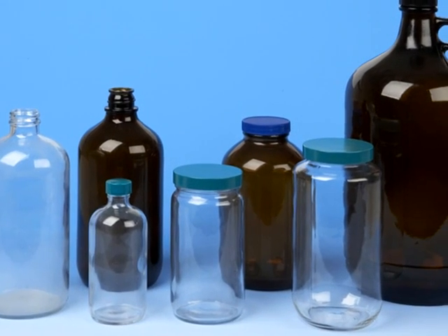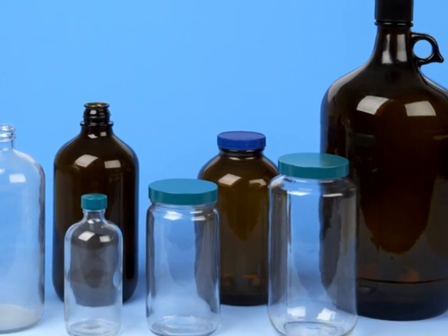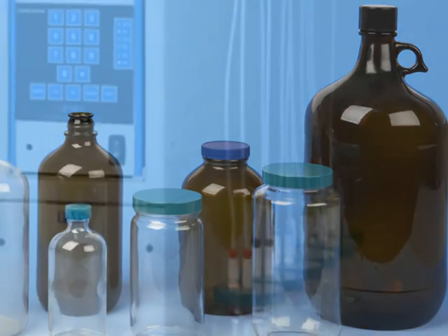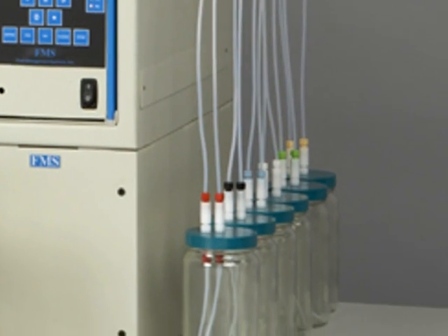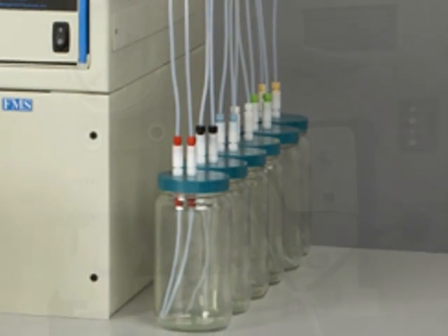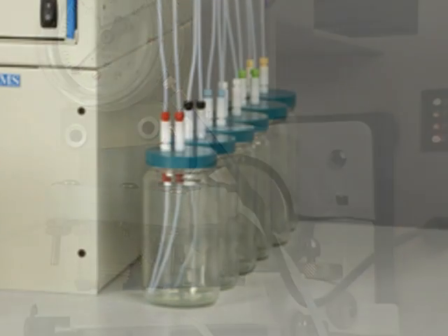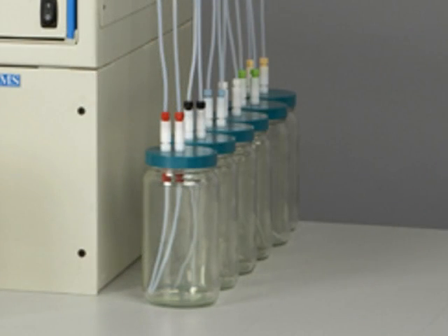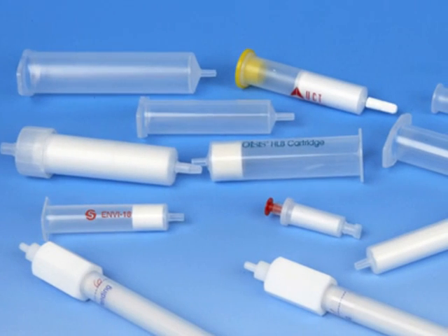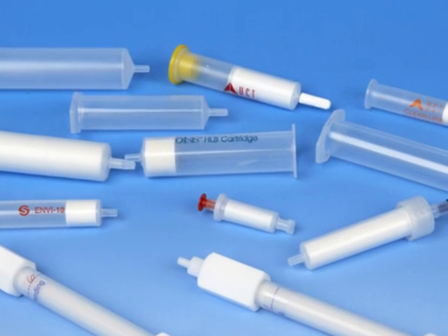With the PowerPrep SPE, you can run samples from 2 milliliters to 8 liters with the same unit. The PowerPrep SPE system design allows for various cartridges, column sizes, and chemistries, giving the end-user flexibility to use the same unit for all sample types.